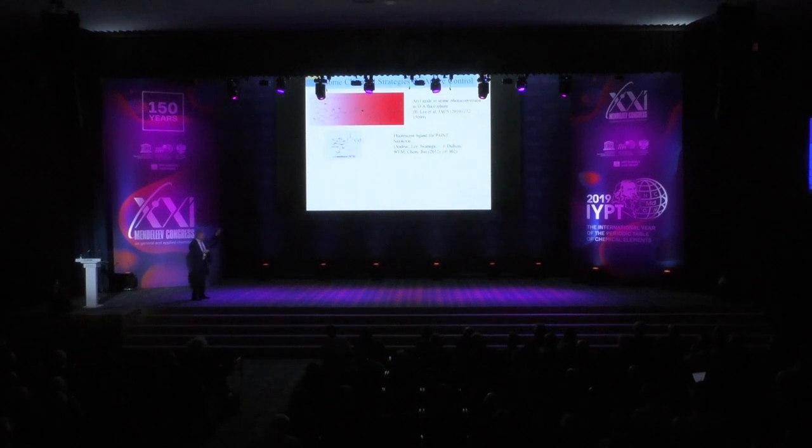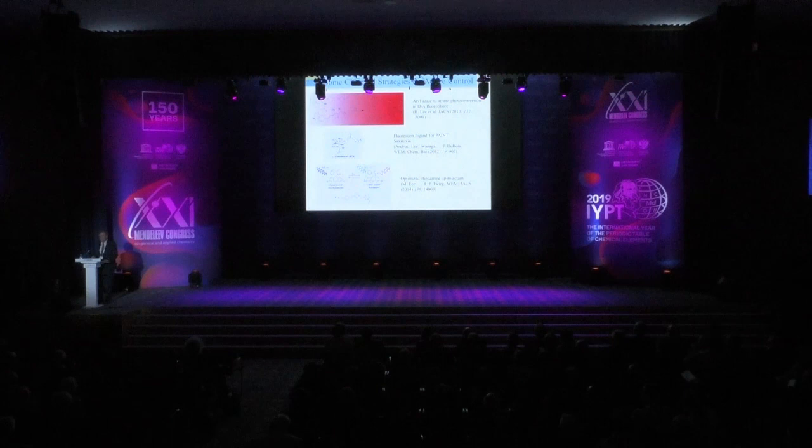It's a technique called PAINT. Another example, here's a rhodamine spirolactam that can be opened by irradiation, which converts a dark molecule into an emissive molecule, and so on. But I want to say that there's a continuing need from our synthetic friends to come up with more molecules that we can control in terms of whether they're emissive or not.